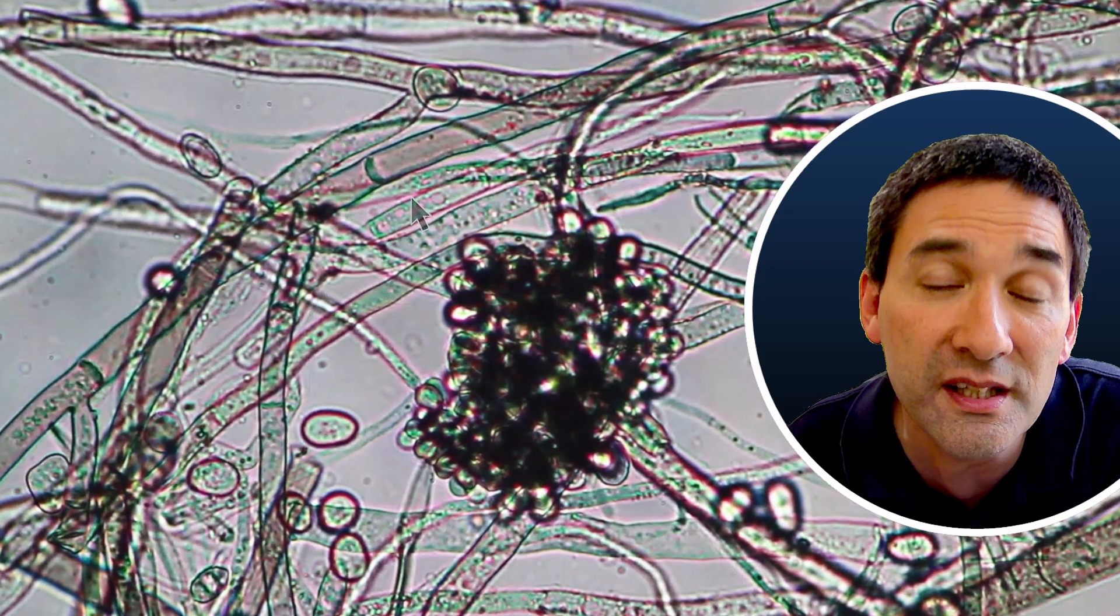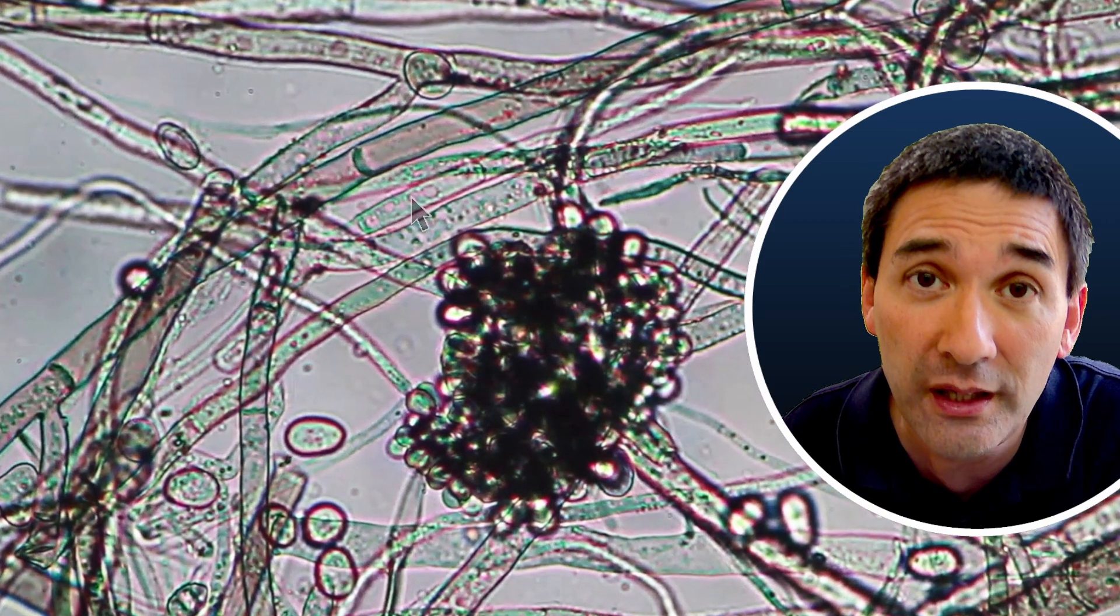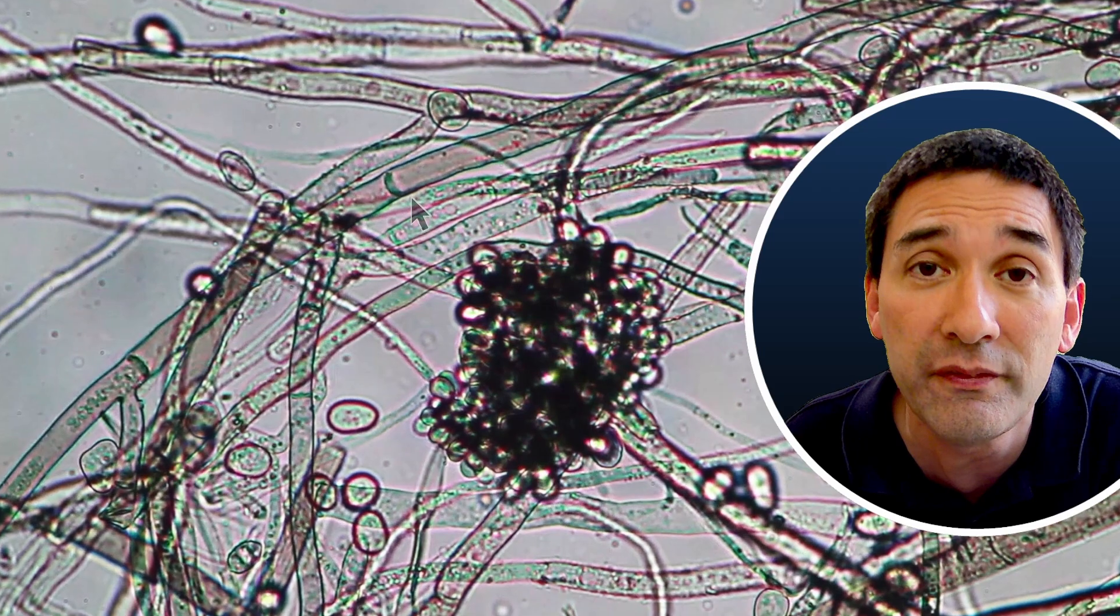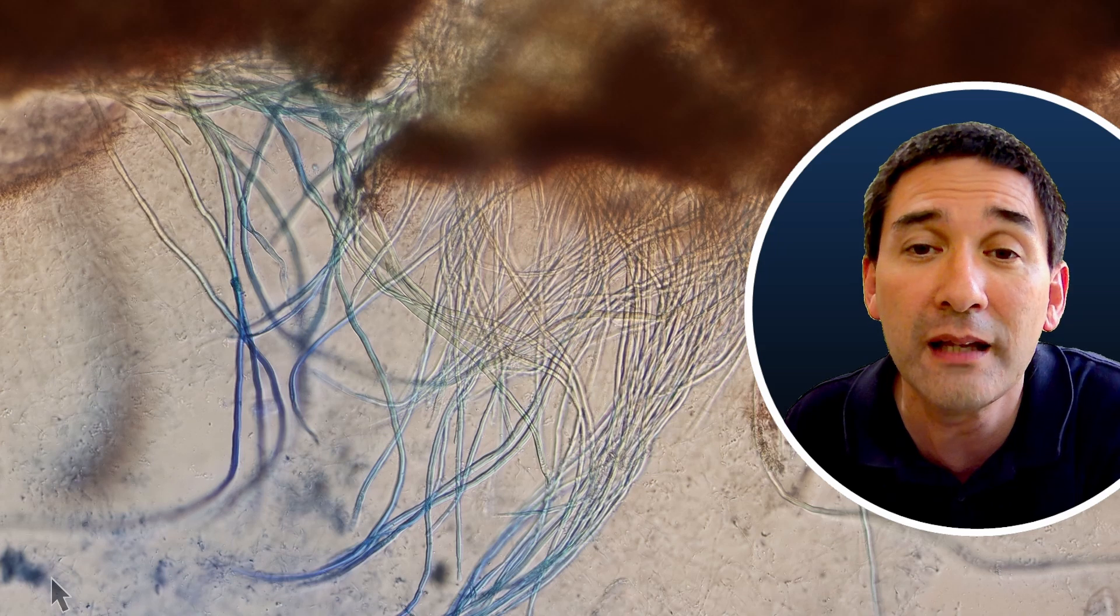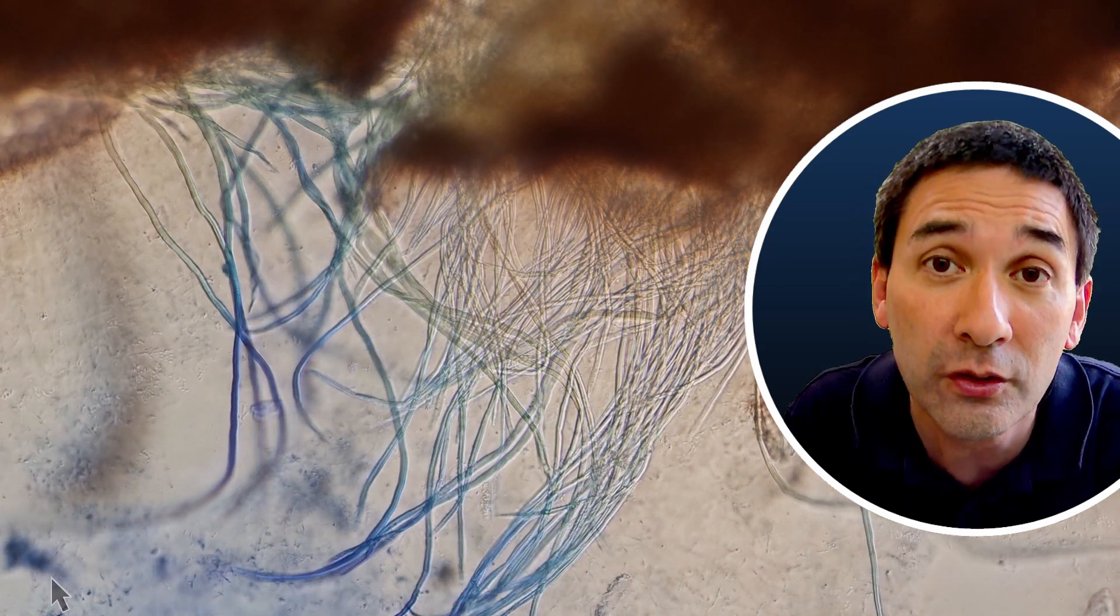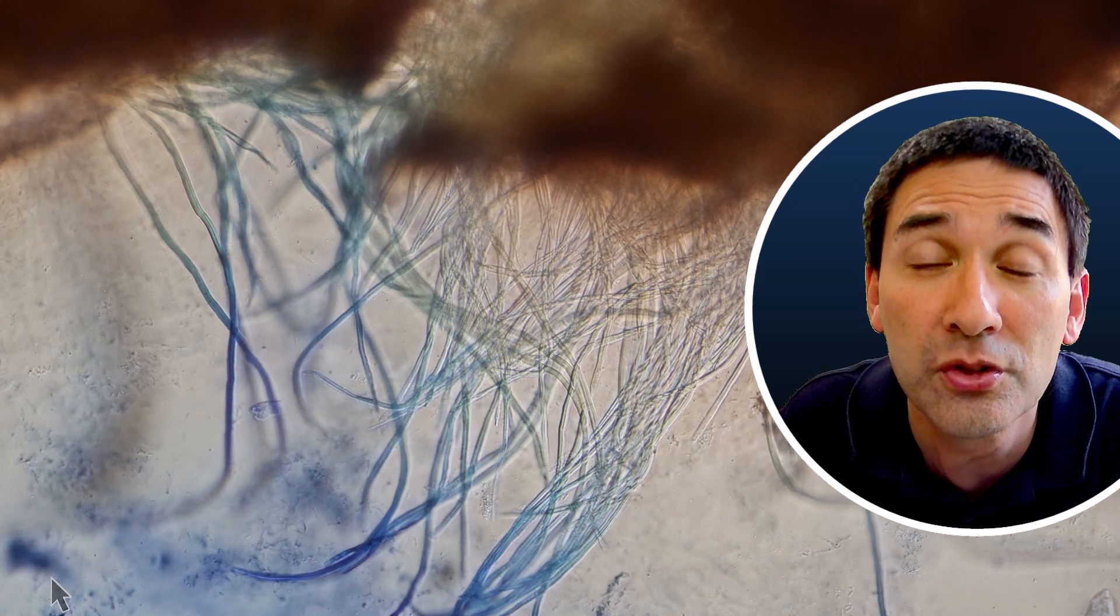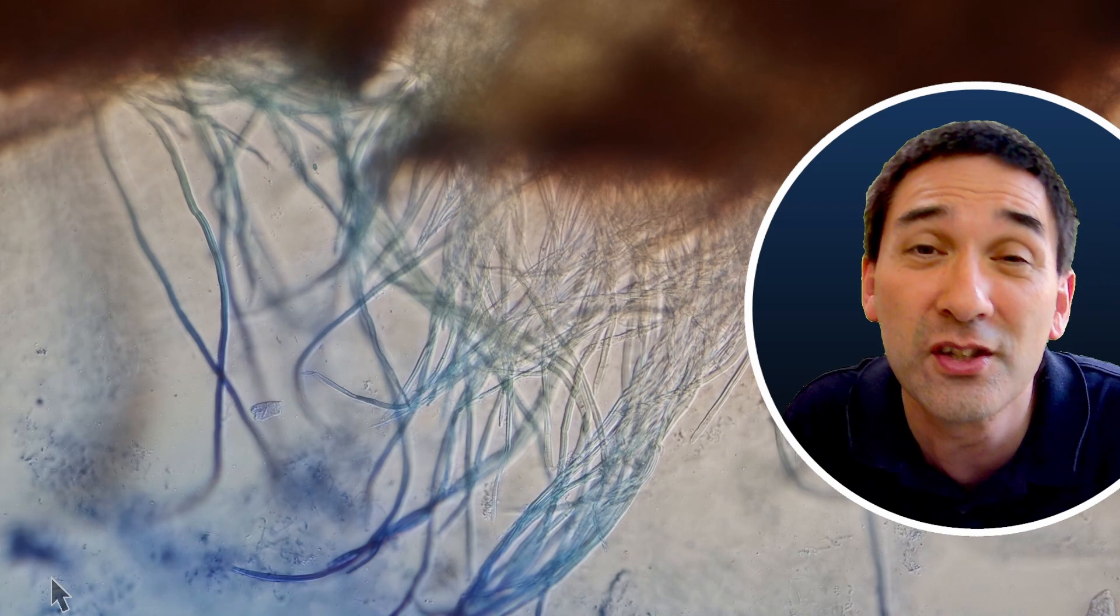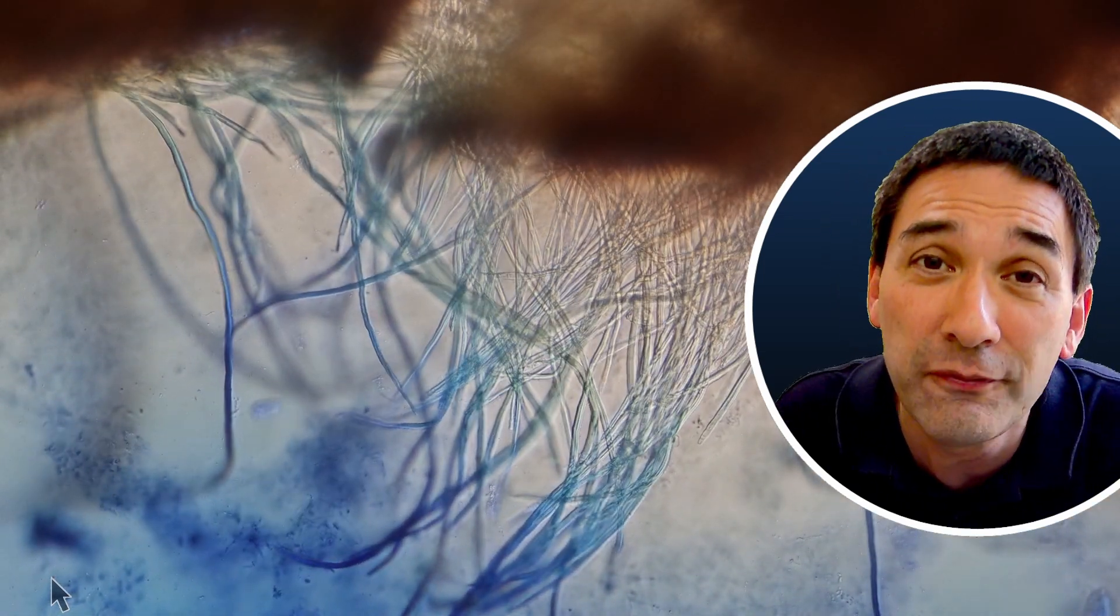But the aseptate fungi like this black wood ear mushroom looks quite a bit different. And why is this of interest? It's of interest because the cell theory states that all living things are made of cells, and also that the cell is the basic unit of life. So we expect all living things to be composed of individual cells. But some of those aseptate hyphae can be quite long, and I researched a little bit and found out that in some fungi they can even be up to several centimeters long. Now it's a question of definition. Is this actually one hyphae? Is this one cell or are these multiple cells fused together? How do we actually define that?